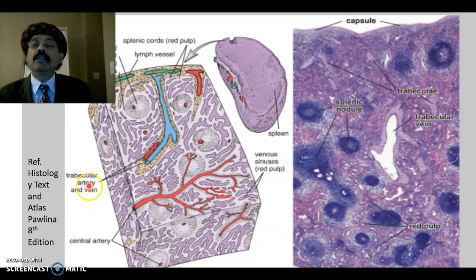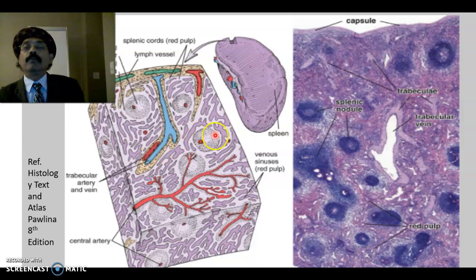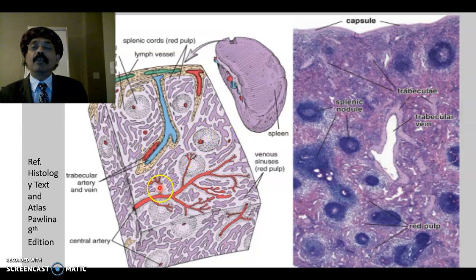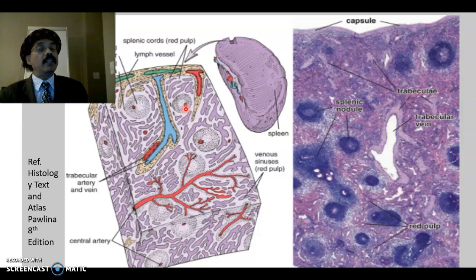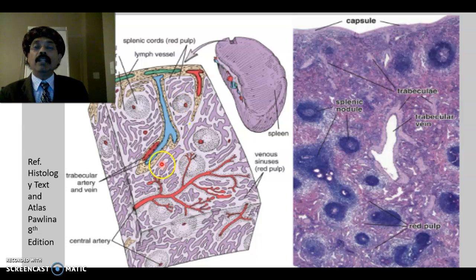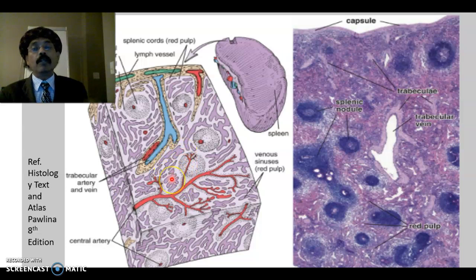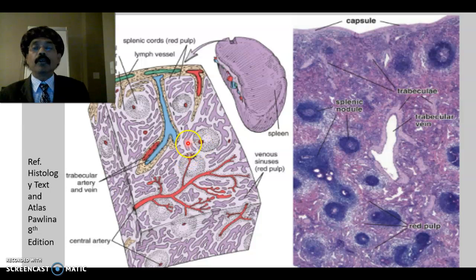Looking at the trabeculae, we can see the trabecular artery and also the trabecular vein. Then we have the lymphatic nodule with the central artery — the central artery is at the periphery of the lymphatic nodule. These are the sinusoids, in a reticular cell mass with a reticular fiber network.